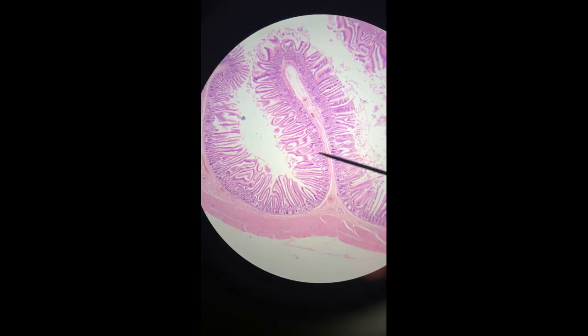The intestinal villi and then the other big fold that you can see, we'll find it, is a circular fold and all of those things are visible right here. Right there.